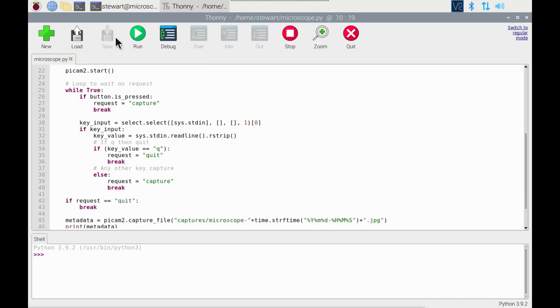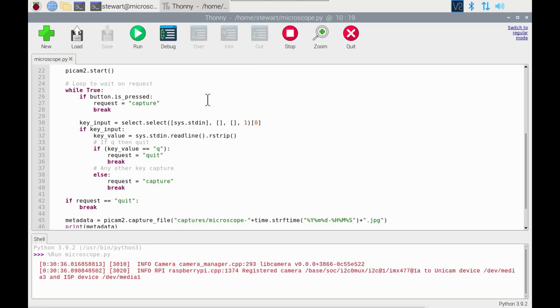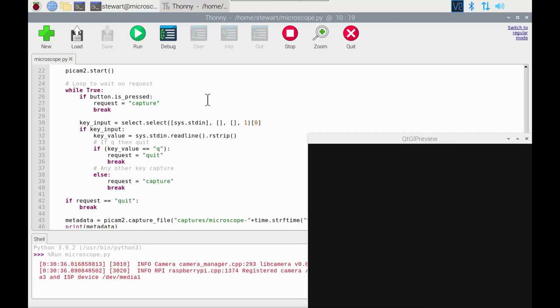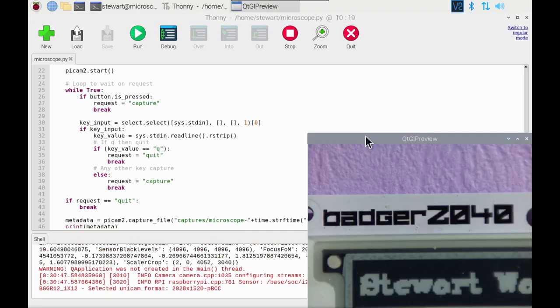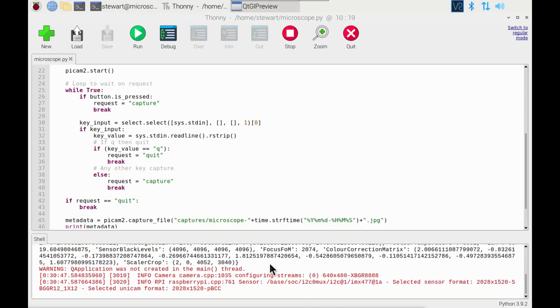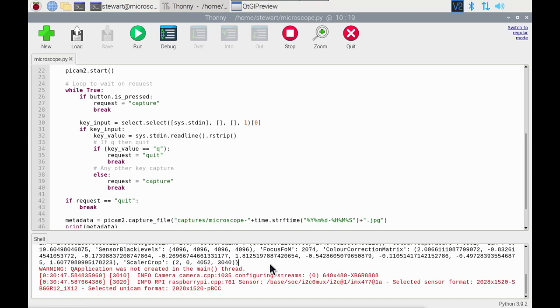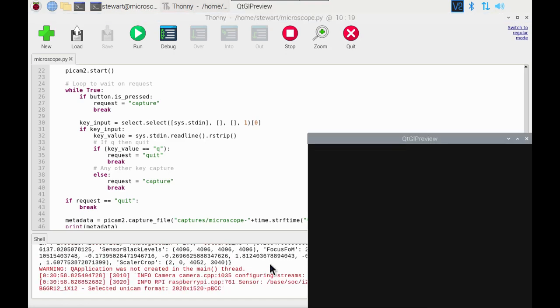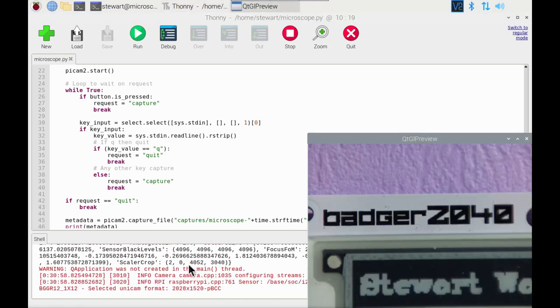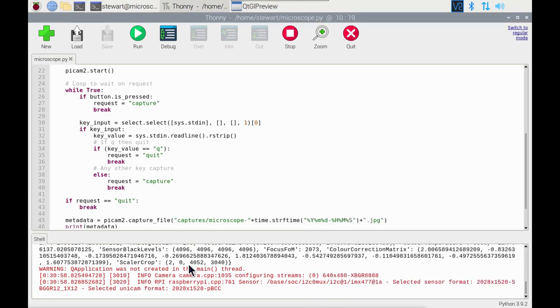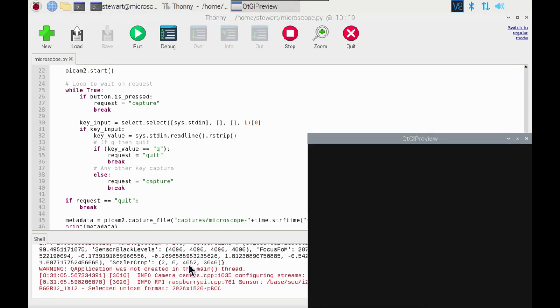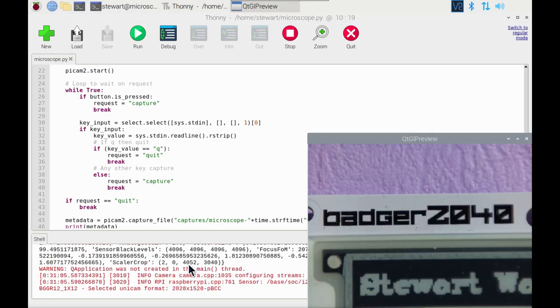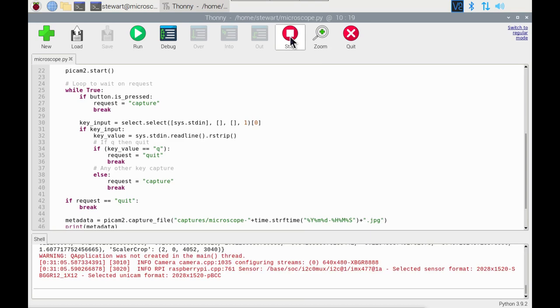We can try that by clicking run. Now you see it brings up this preview. Now one thing you can do, you can just press the button, which is really what it's designed for. As you can see the preview disappears, takes the photo and then returns the preview. Or you can use the keyboard to take another, and you can just hit enter. The one thing that doesn't work is the quit option. If I try and do that then it doesn't work on here. So to stop when running in Thonny, just press stop.